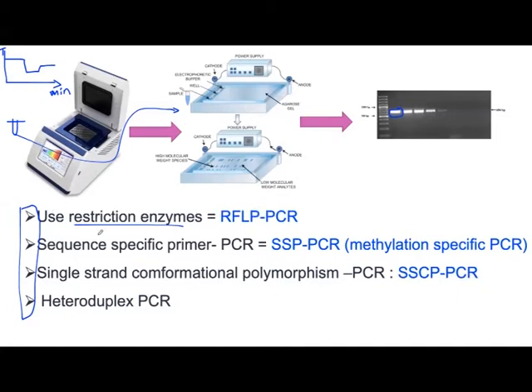But what I'm trying to tell you is that if you want to collect data on the PCR, it's not only doing the PCR, like thermocycling; you need to do an extra experiment, and this will take time. So instead of getting data in one single day, you can get it after 2 days, and also the lab technician will be very unhappy if you give him like 100 samples with ordinary PCR. So that's why people invented what is called real-time PCR.